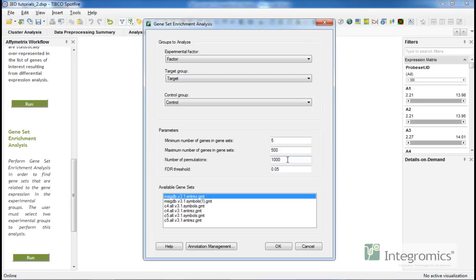We can also filter our results based on the p-value adjusted for multiple testing using the FDR method of Benjamini-Hochberg. Only results with adjusted p-values smaller than the selected threshold will be shown.